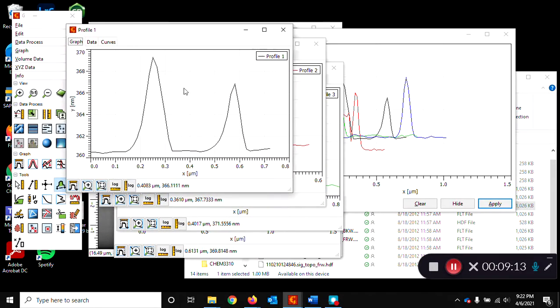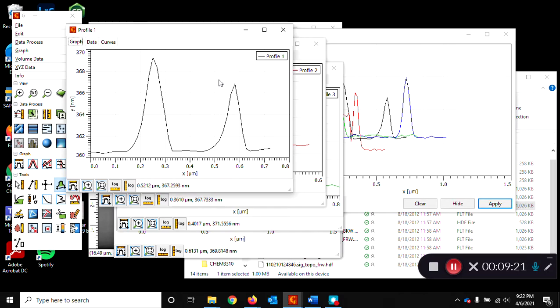So you can measure those particle sizes, or the heights, and that gives you particle sizes, and make a table, and then report in your lab report the mean and the standard distribution to give a particle size distribution. Or you can plot it as a histogram, which is also often done with this type of measurement study, and that's all.